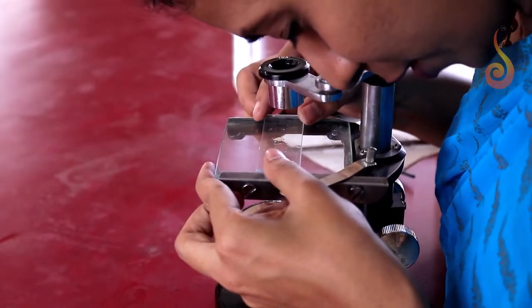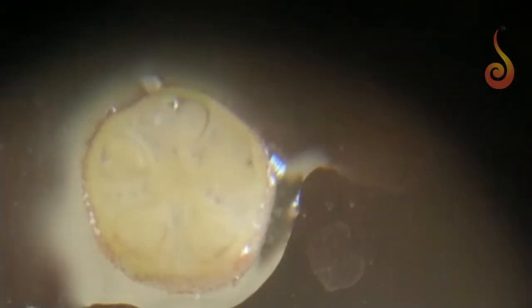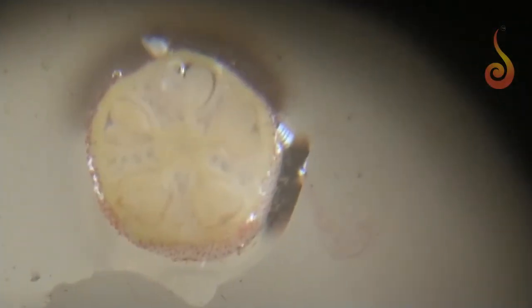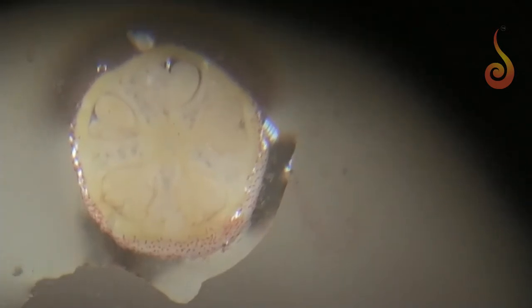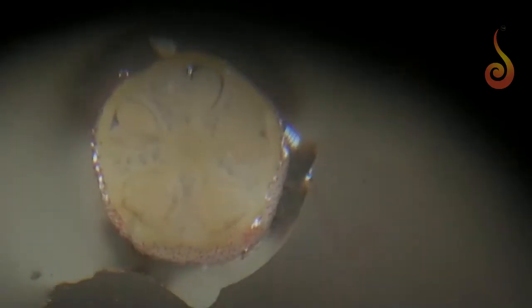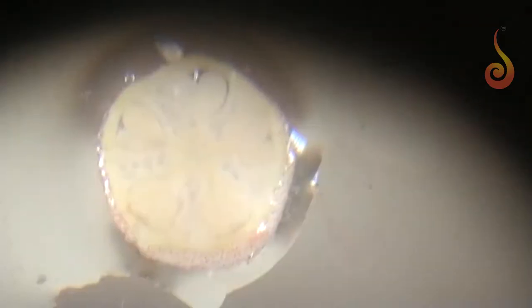What you need to observe here is the number of locules in the ovary. I can see 5 locules, so this is a pentalocular ovary. Also, the ovules are attached to the axis in the center, so the placentation is axile.